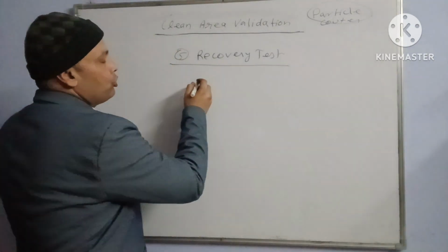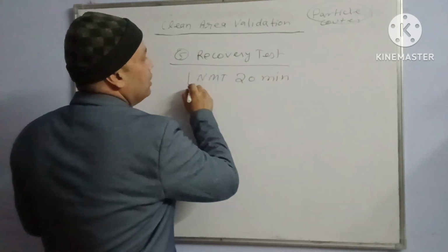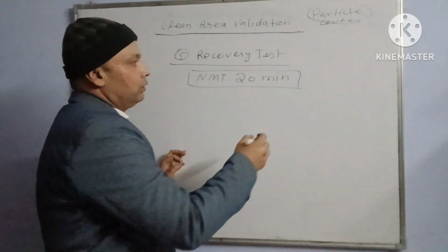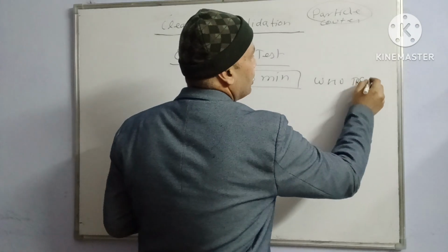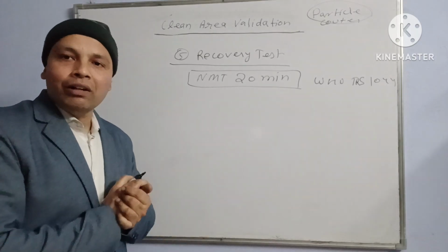Area recovery should be not more than 20 minutes as per WHO TRS 1044, which we have discussed. Recovery time should not be more than 20 minutes; it should recover within 20 minutes.